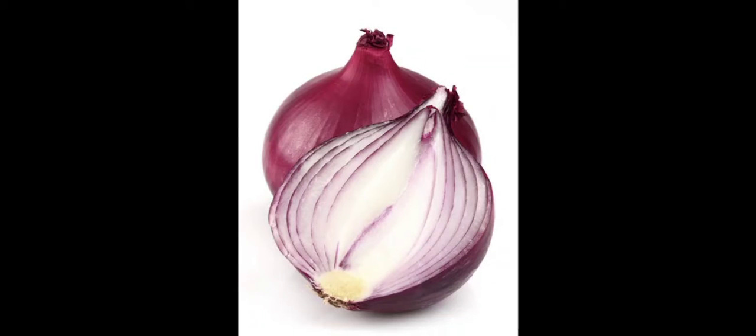So in the second activity, when we are taking the onion, we should not stain it, only the cell has to be observed, whereas in the fourth activity you have to stress on the nucleus. So in order to observe the nucleus clearly, we have to use a stain, whereas in the second activity we don't need any stain. So in the fourth activity, to observe the nucleus, we need safranin or methylene blue stain, or even red ink is enough.